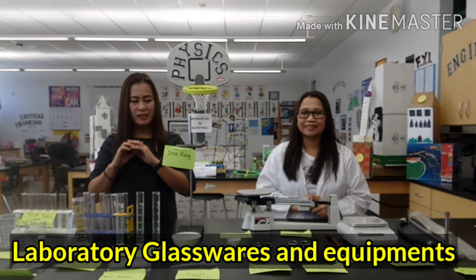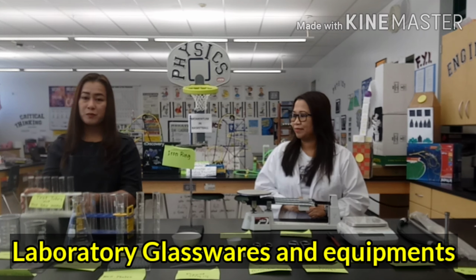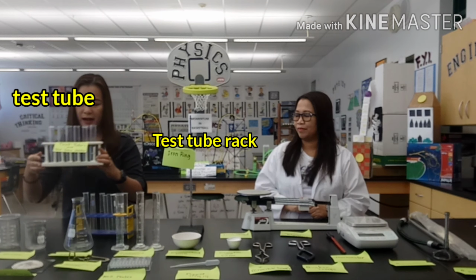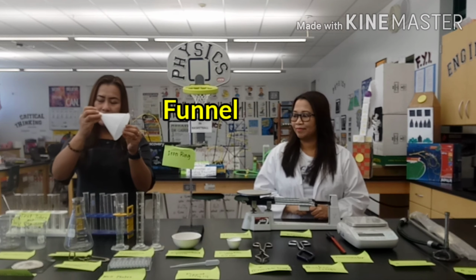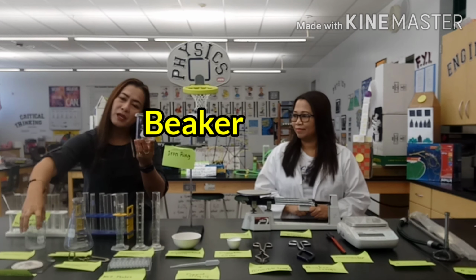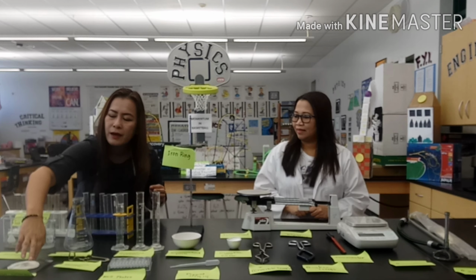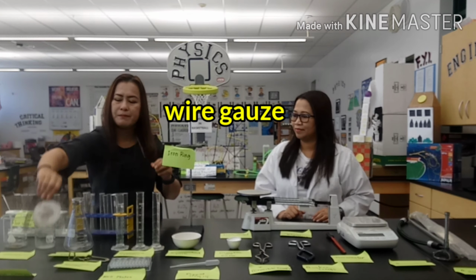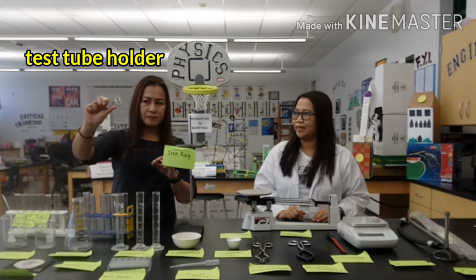Hello everyone, once again, I'd just like you to know what we are using inside the lab. And here we have the test tube rack and the test tubes. So this is your test tube and this is your test tube rack. We also use the funnel, this one, we call it a funnel. We also have here the beaker. We have a big beaker and the smaller one. They have actually different sizes. We have here also the wire gauze. Here, a test tube holder, used to hold test tubes.